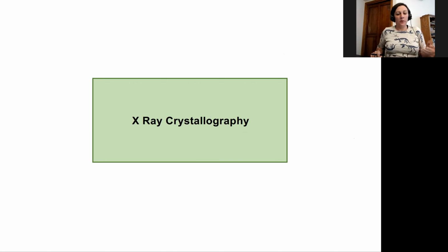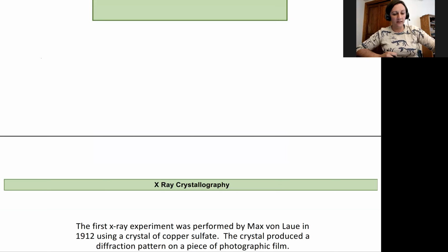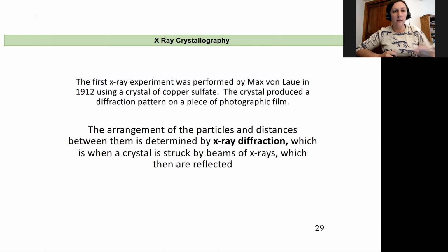In this video, we're going to talk about X-ray crystallography, which is a pretty powerful tool for determining exactly what you made when you're not sure what you made.